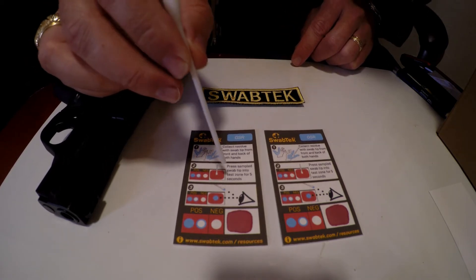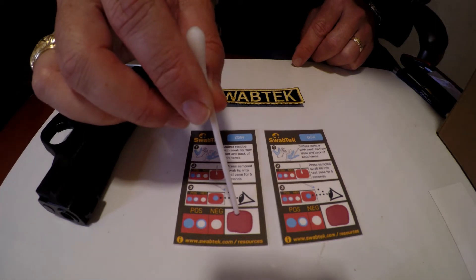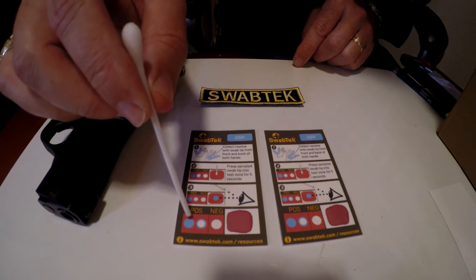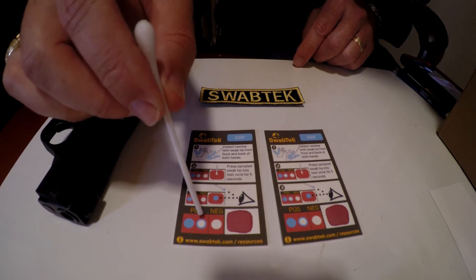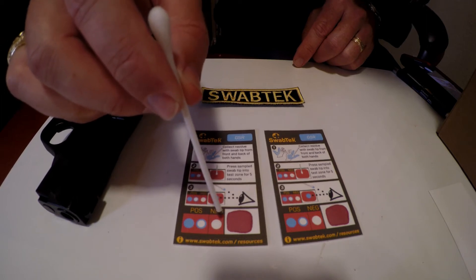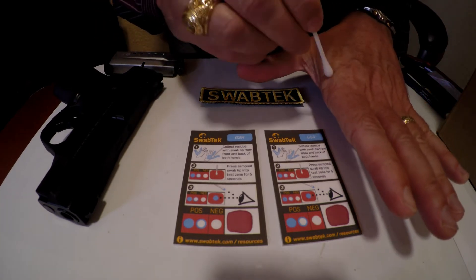It will tell you what to look for on the test, but you're going to be testing in the reagent zone shown here. You're going to look for a blue spot or a white spot with a blue ring as positive indications. A white spot or no color change with no blue is a negative.